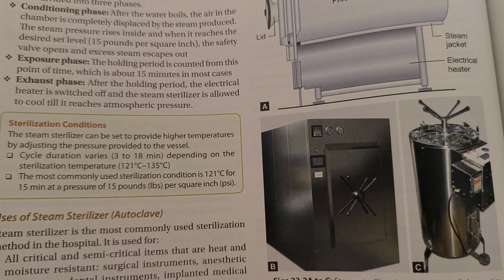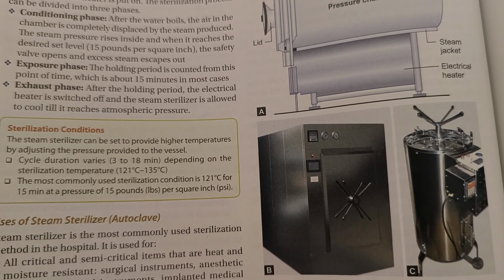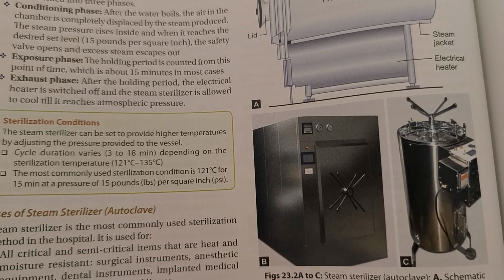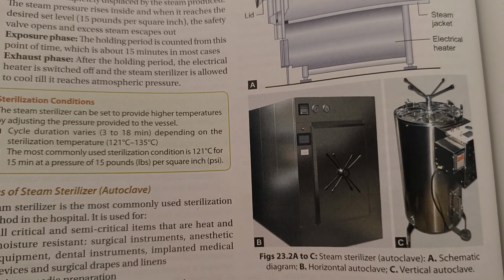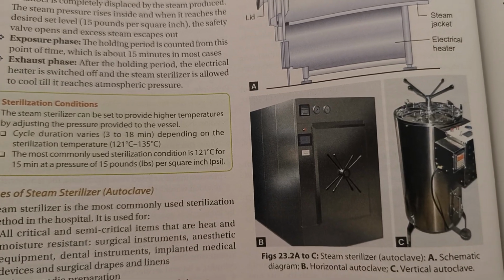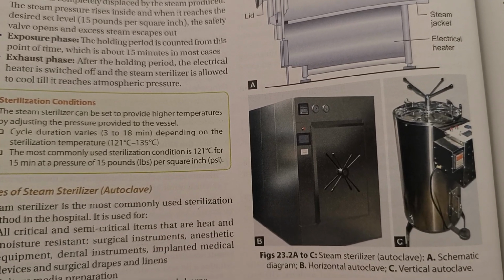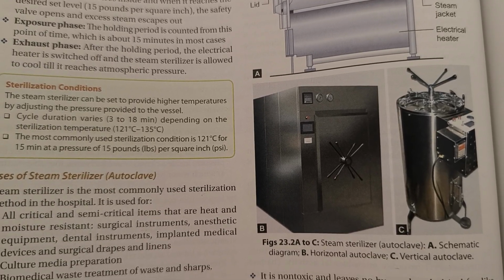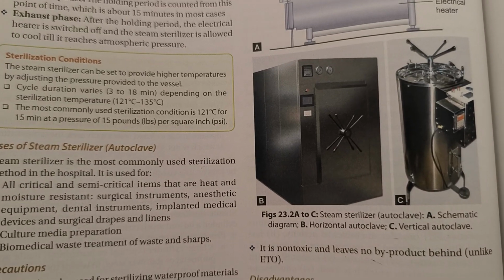Conditioning phase. After the water boils, the air in the chamber is completely displaced by the steam produced. The steam pressure rises inside, and when it reaches the desired set level of 15 pounds per square inch, the safety valve opens and the excess steam escapes out.